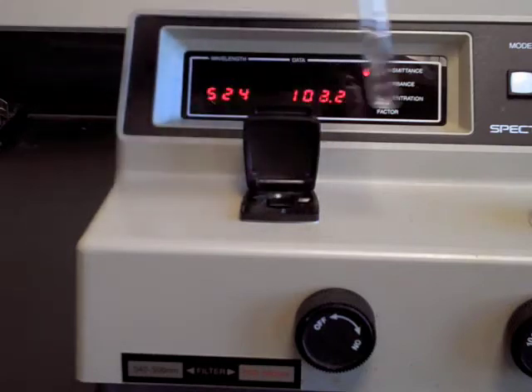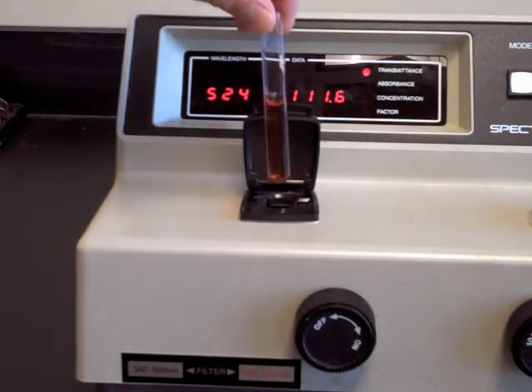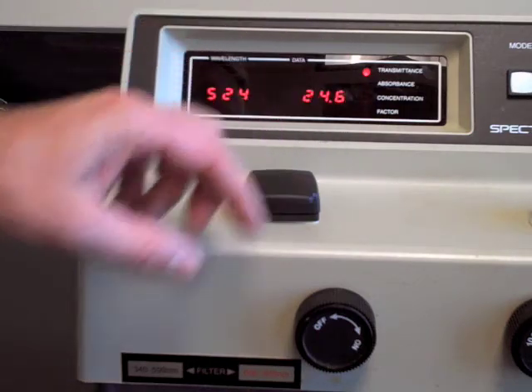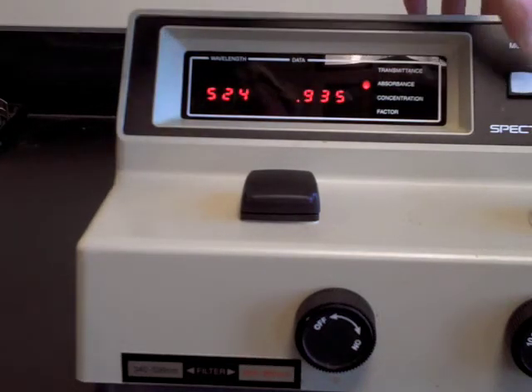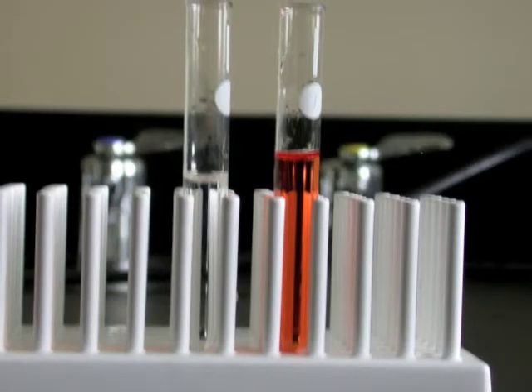After setting the 100% transmittance with a blank solution, press the mode button to move to the absorbance mode. The absorbance of a blank solution should be zero. The absorbance of this standard solution is 0.935.